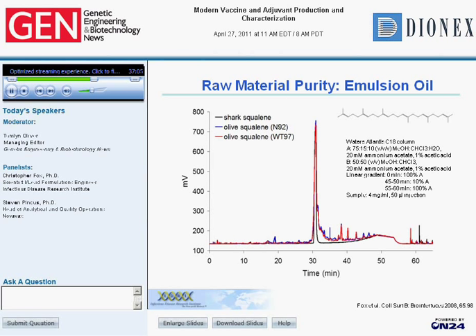The squalene is available in high purity from shark liver, and the HPLC CAD trace is shown in black of the shark-derived squalene in this figure. However, for regulatory and sustainability considerations, there is interest in obtaining squalene from non-animal sources, one of which is olives. So we're showing in red and blue the HPLC CAD traces from two different vendors of the olive-derived squalene. As you can see, the HPLC CAD reveals several impurities in the olive-derived material compared to the shark-derived material.